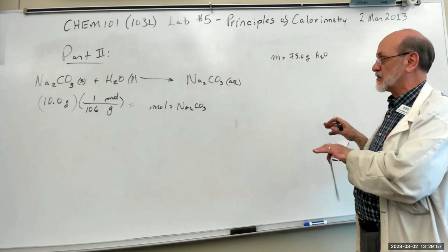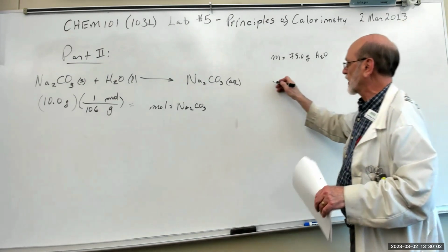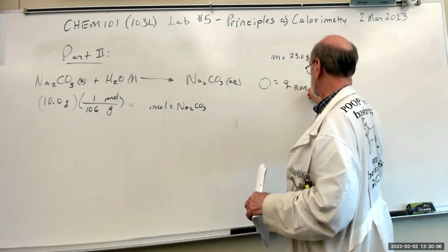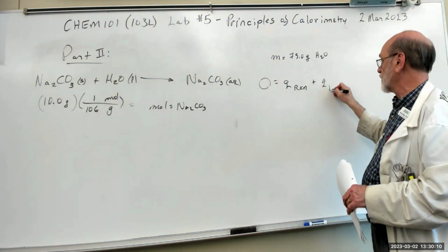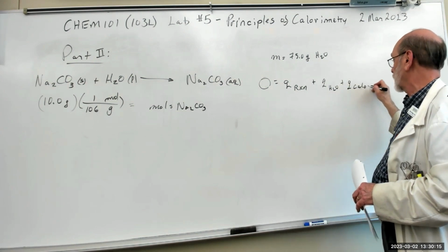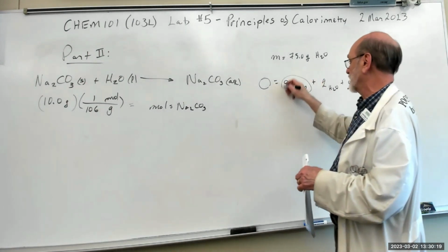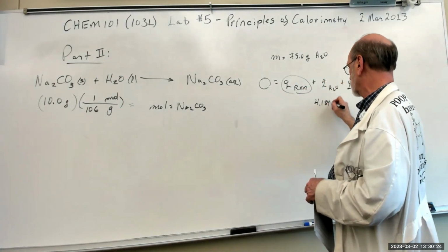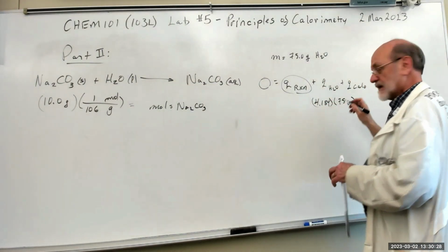After you record the temperatures, the before temperature and after temperature, what's it going to look like? You're going to have another Q of the reaction. Then you're going to have a heat change for the water, and a heat change for the calorimeter, just like before. This is going to be intact. That won't change. And this one's going to be your 4.184 times 75 grams.